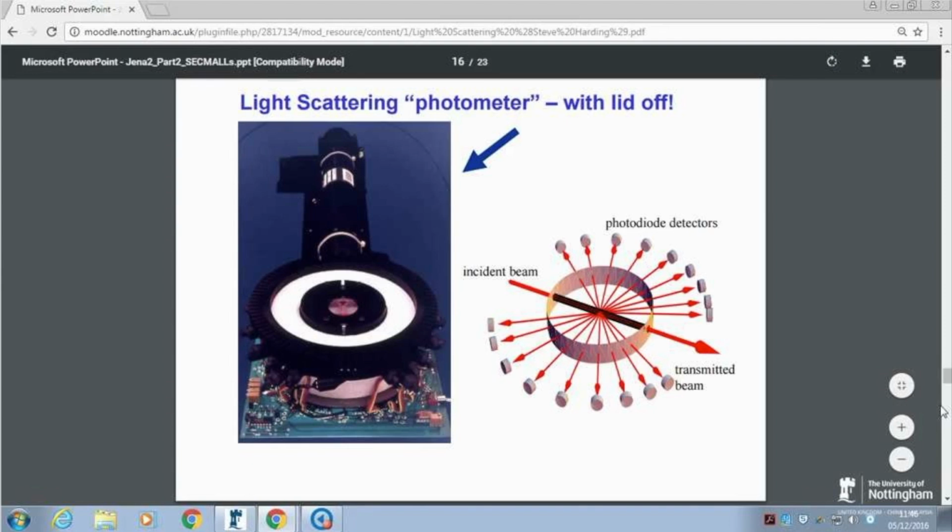Light scattering struggles to pick up the molecular weights properly. But if you've got online something which is separating the molecules out for you, brilliant. So light scattering's happy, and the chromatography is happy because it can't measure molecular weights absolutely because it hasn't got the calibrations, but the light scattering's doing it for you. So it's a great idea.